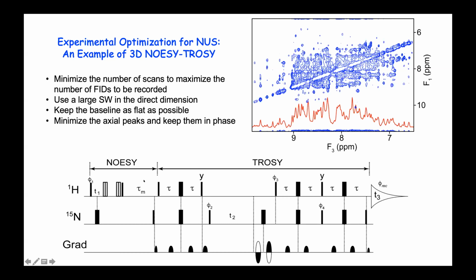Now, I have to admit, this is a short mixing time. I don't know which data set, but it's short mixing time, and it's quite a low temperature. So the solvent exchange is not that fast.